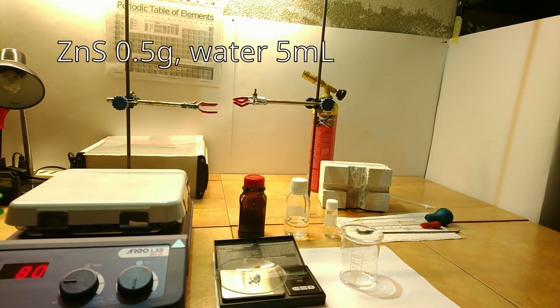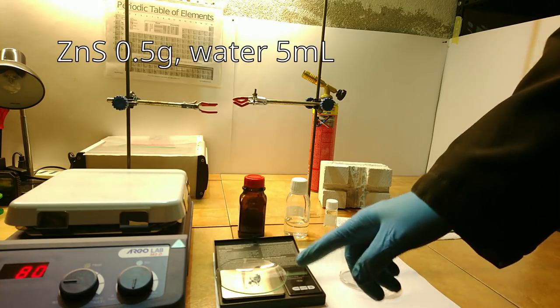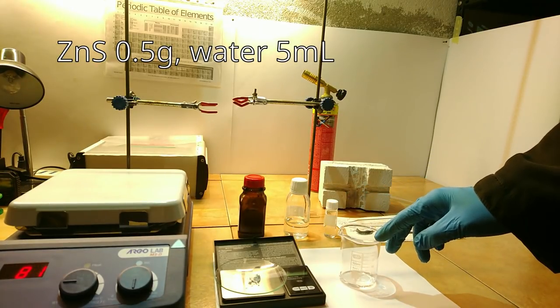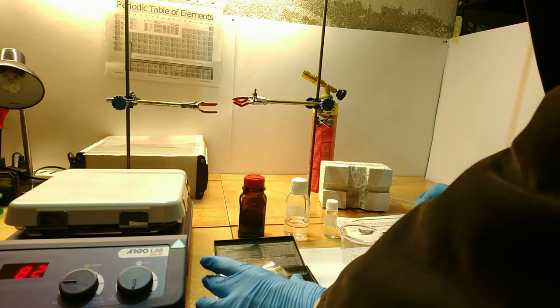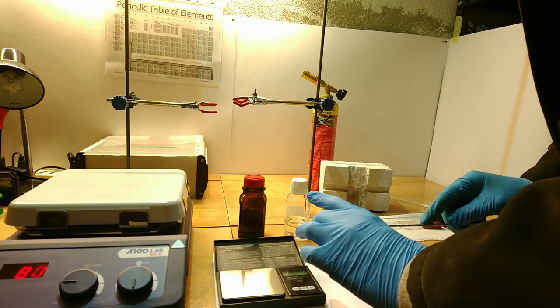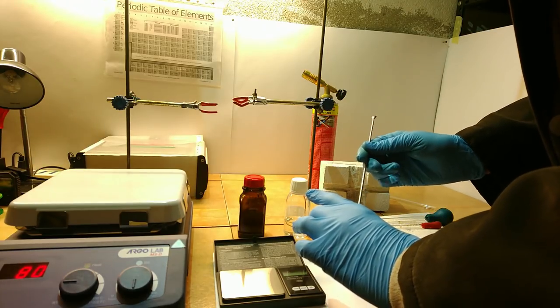To start, you need to make a slurry with half a gram of zinc sulfide and 5 milliliters of distilled water. Purity is key, as even a few parts per million of elements such as iron would destroy the glow.